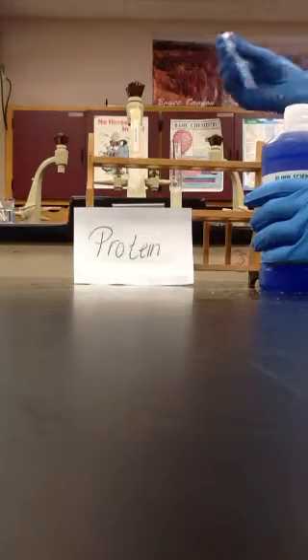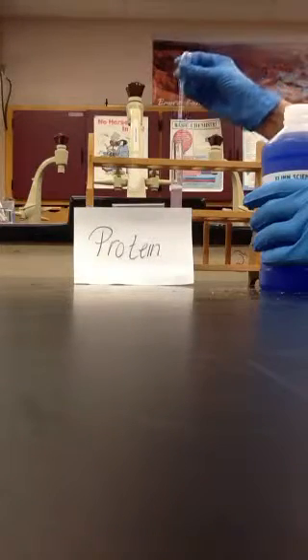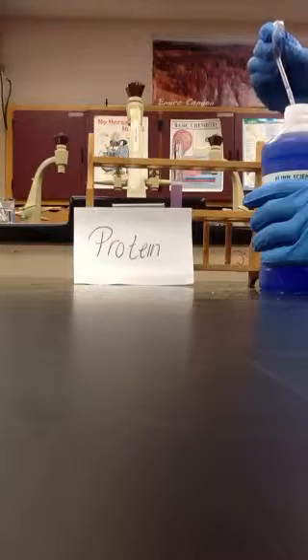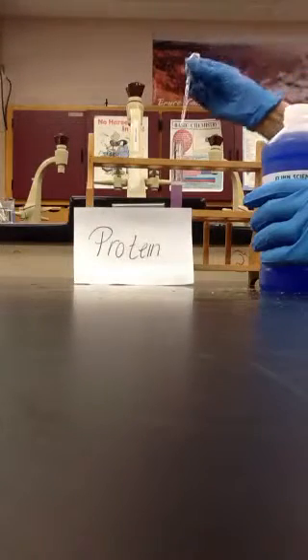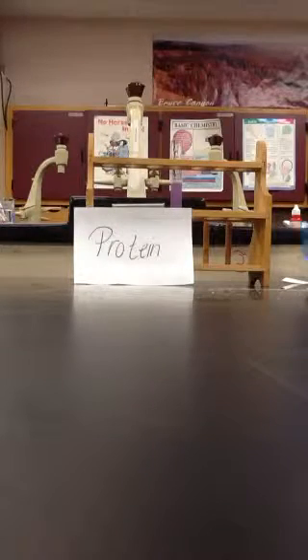I'm going to add 1, 2, and a half. And because there's so much protein in my sample, it turns a pinky purple color right away. That is a positive result.